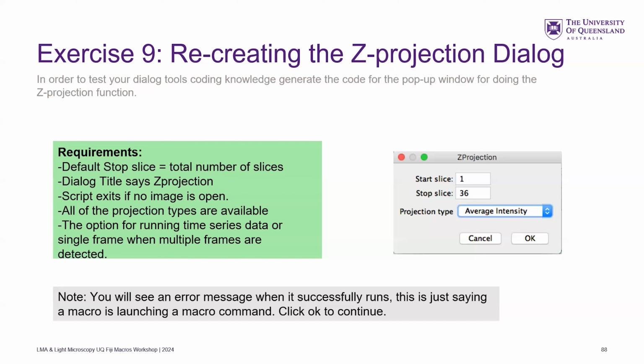When you run it, you do get a little error saying that your script is running a single function, just ignore that. But we can have a go at doing that.